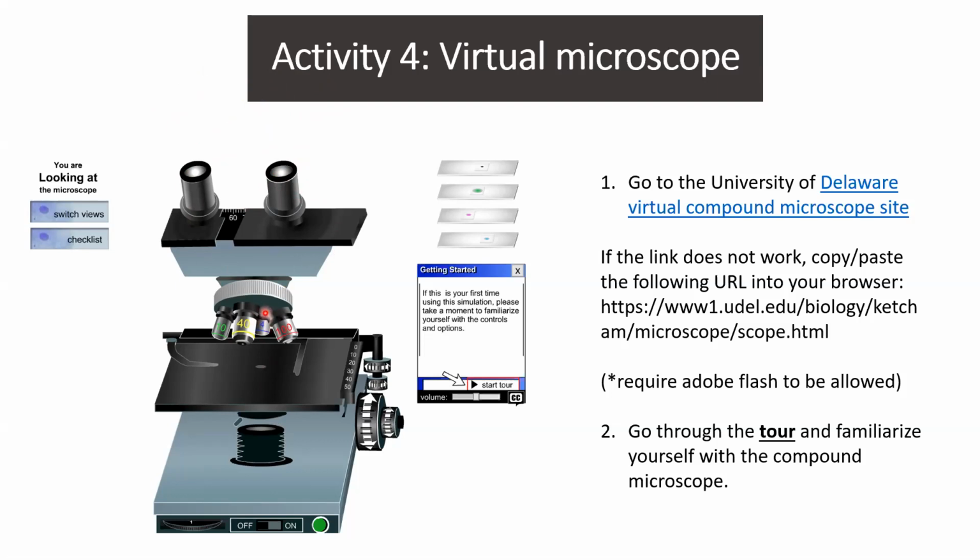microscope is using the 4x objective lens, and you will use the coarse adjustment knob to bring your stage all the way up. You also want to center your specimen, so you want to make sure that the center part of your specimen is right below your objective lens. And you will center it using the X and Y axis to move this platform stage.